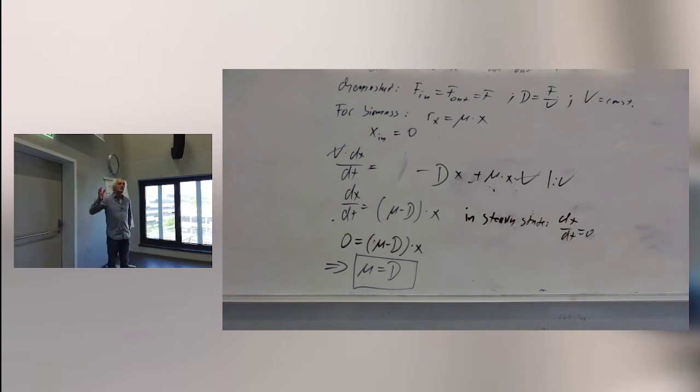If I pump in more or less, it will take some time until they adapt again. So that's clear. We will do that in the experiment, so we can also measure how long it takes. But if I don't fiddle around with the dilution rate anymore, I will have an indefinite steady state, and an indefinite specific growth rate which equals the dilution rate.